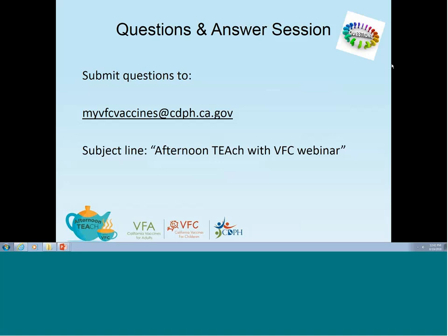Is it recommended to check all units' data loggers if we have an excursion in one unit? Not necessarily. Thank you for the question. If you have an excursion in one unit and for some reason you found that something happened to the power or a circuit and you have more than one unit in that room, yes, you might actually need to check other units. But if you have multiple units in different stores and one of them is alarming, then you just check that unit. That's what we actually recommend for you to check morning and afternoon, so you can check those.